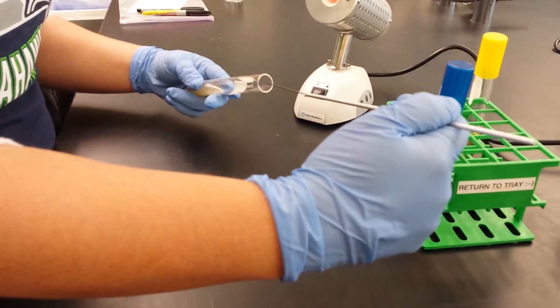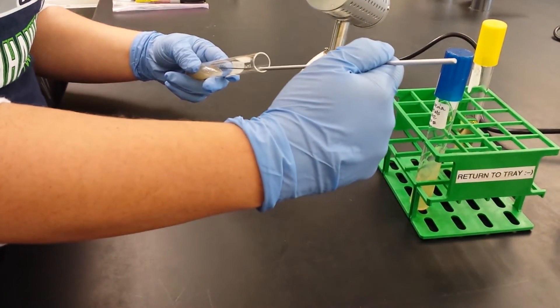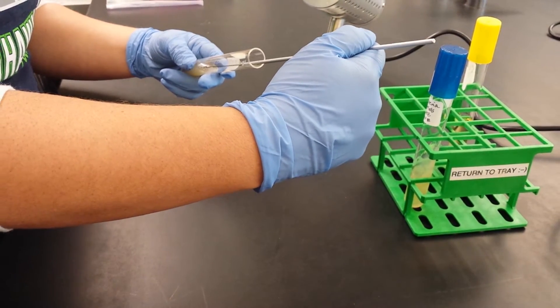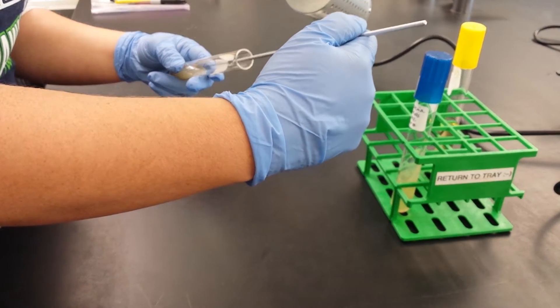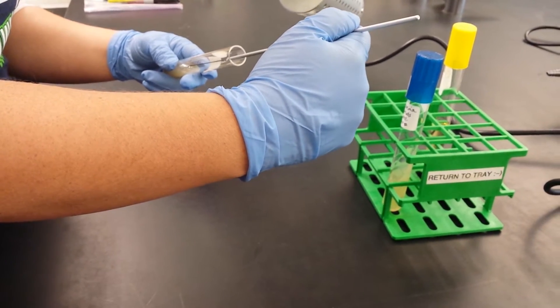So I'm going to put the loop in to pick up a little bit of bacteria. And I just kind of rub, we don't want to pierce the agar, get a little bit of bacteria on the loop.